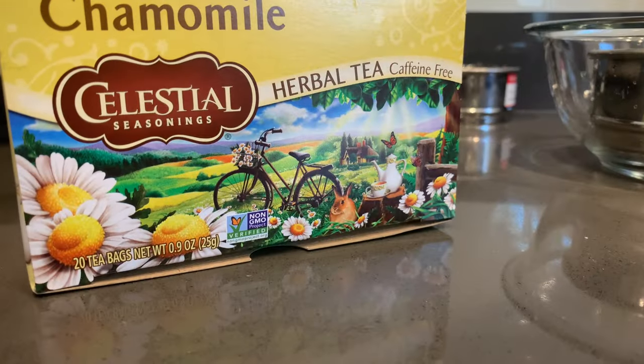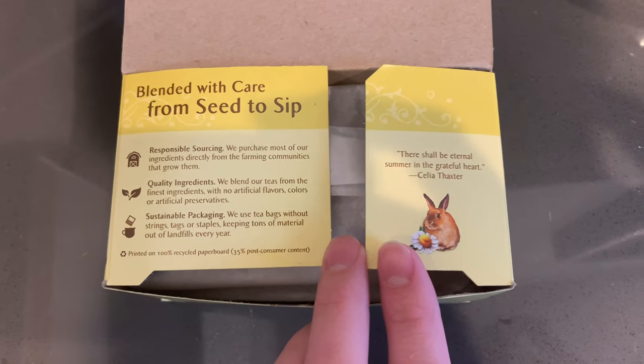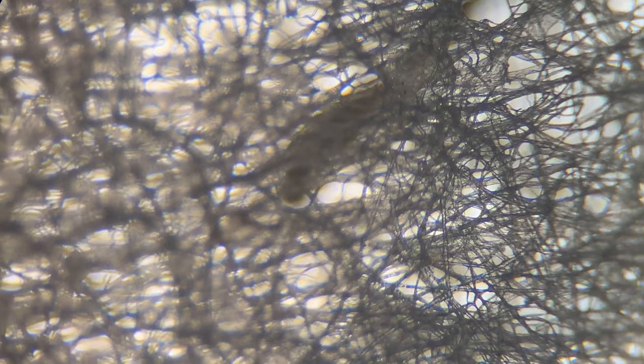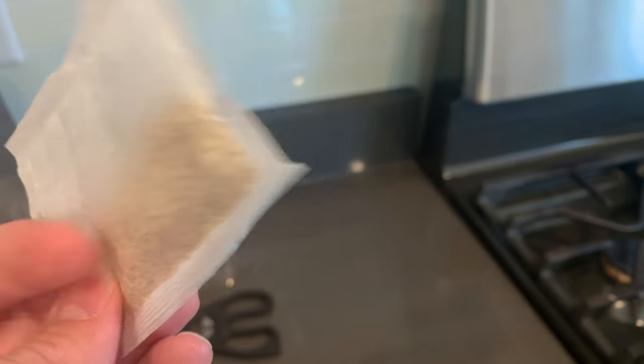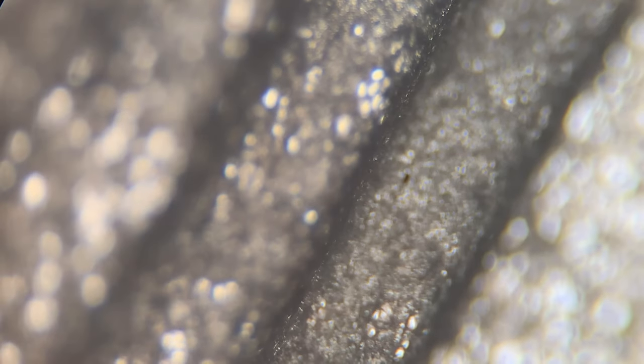Next up, we're going to be looking at Celestial Seasonings — this is the tea that I typically drink. You can see on here there are some notes about sustainable packaging. If you look at it under the microscope before it is steeped and cooked, it is very different than the nylon. They claim to use some papery material. I did find on one Reddit post that somebody asked them in an email if they used any plastic in their bags, and apparently in their response they mentioned that they do still use plastic in the folds that seal the bag. They are still very interested in not using any plastics at all, but at this current point they haven't found a good alternative yet.